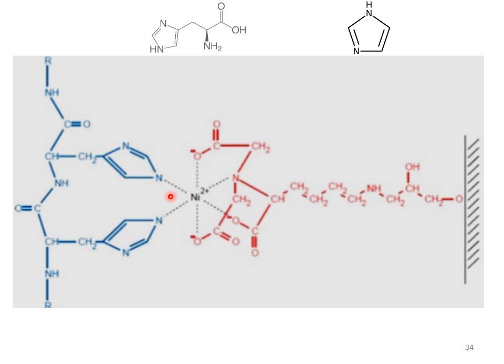So in this manner, affinity purification increases the yield of the protein, and it also increases the efficacy of the process because it only requires one step of chromatography to get the required protein with a greater yield and high efficacy.